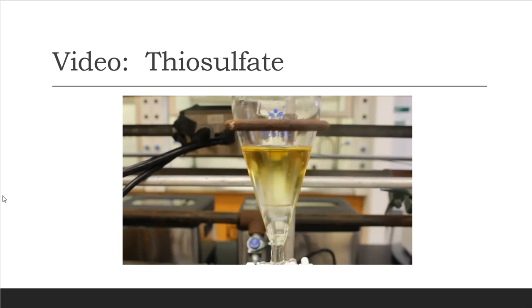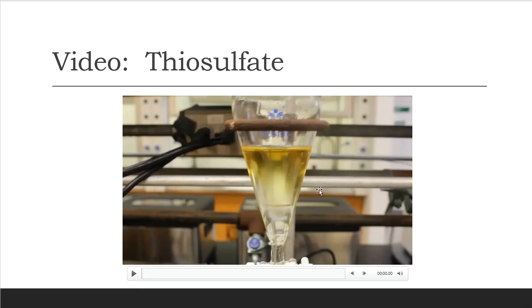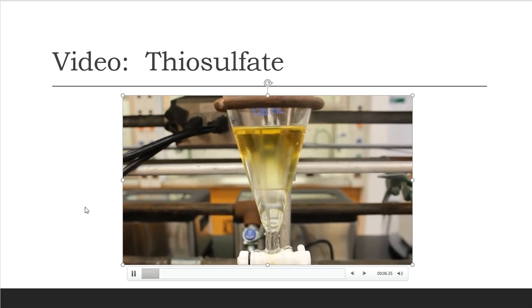So what you're going to see in this video is the moment where I get ready to drain the thiosulfate off. And take a look at what it looks like at this point. I mean, look at this now, right? You can make your observations here, but now look at this solution. Okay, so this is after the addition of the sodium thiosulfate that I made.